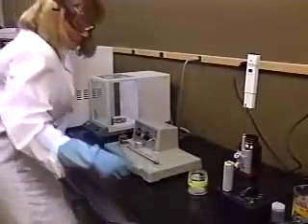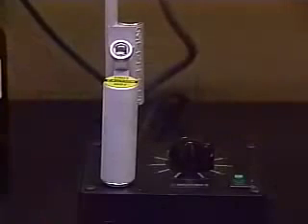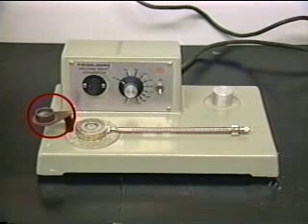The purity and identity of solid organic compounds is generally determined by melting point determination. Our labs use either Mel-Temp or Fisher-Johns melting point apparatuses. On the Fisher-Johns apparatus, this is the hot plate, the thermometer, the eyepiece.